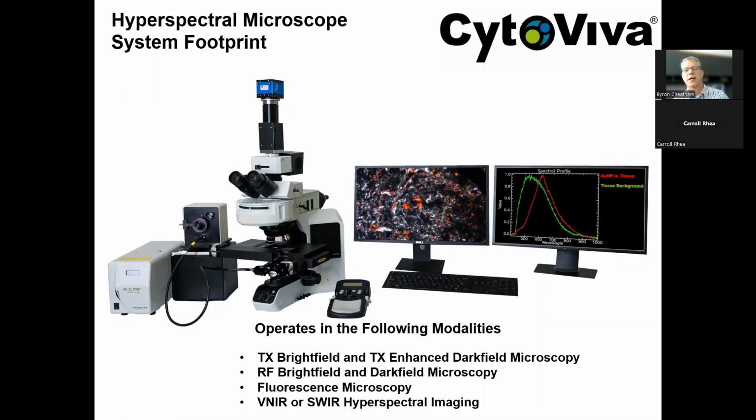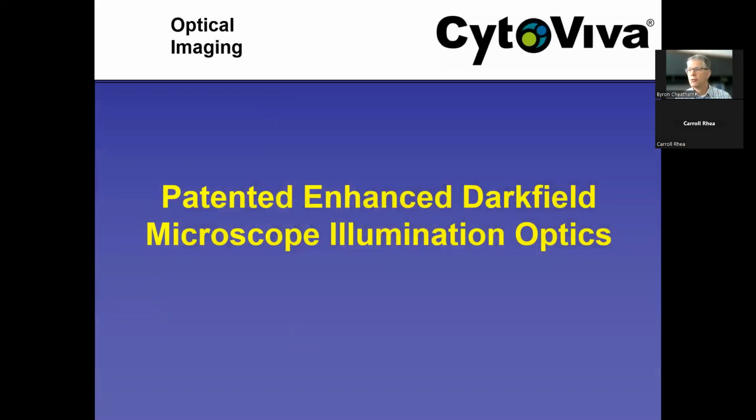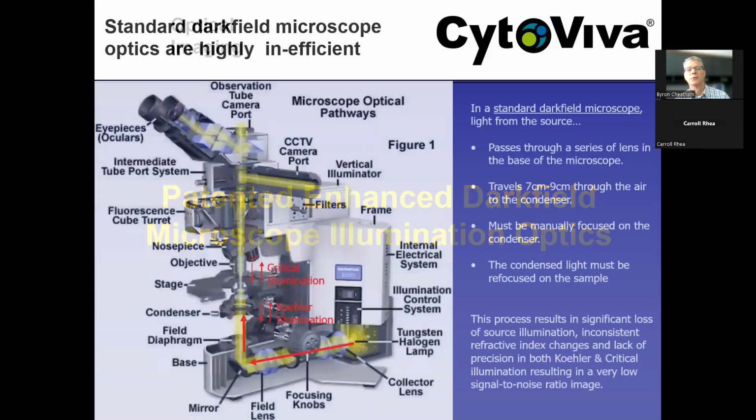We'll go into that in just a second, but we wanted to share with you what the system that captures these images looks like, because it's a pretty basic setup from an optical microscopy perspective, but it allows you to do some super special things. Let's go into what allows us to equip this microscope with the proper optics and spectroscopy to get these really awesome images and spectral data at the nanoscale.